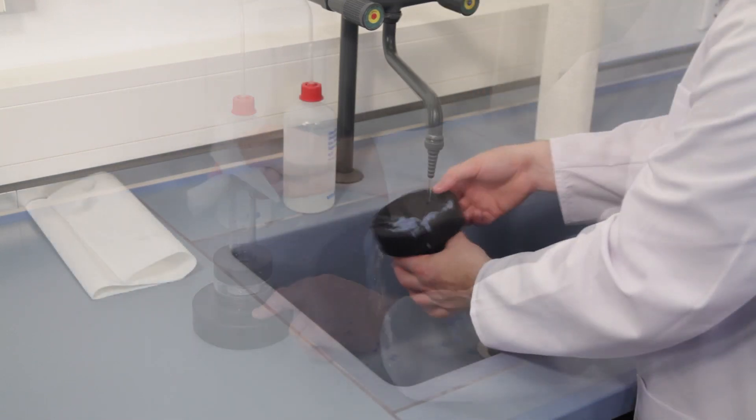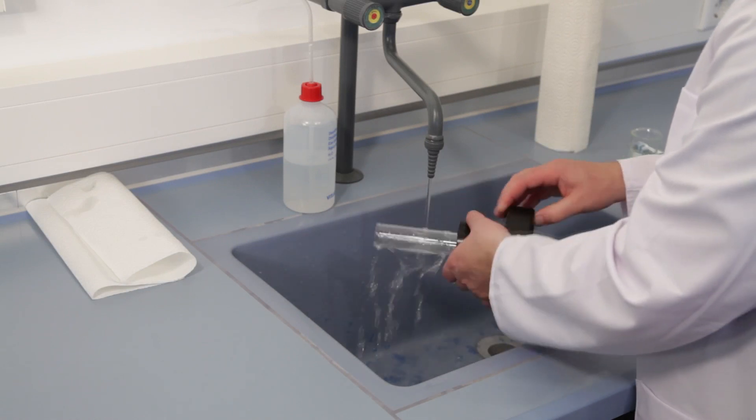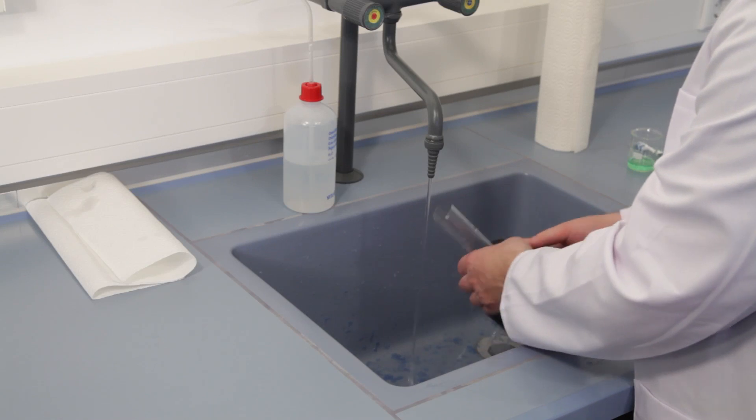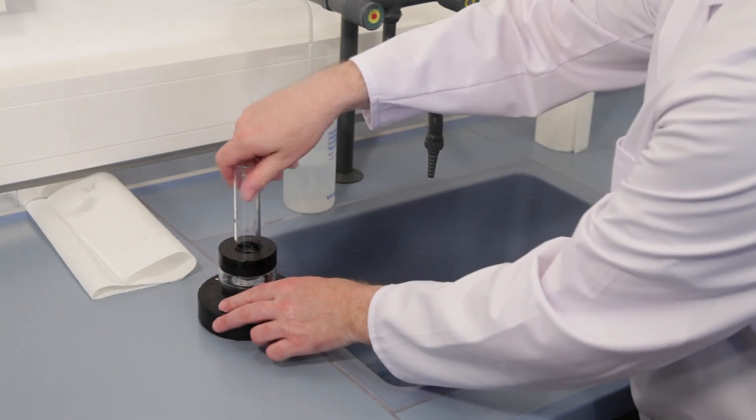In case of heavy contamination or after the end of a trial series, a thorough cleaning of the measuring cell is recommended. Rinse the measuring cell under tap water and disassemble it.